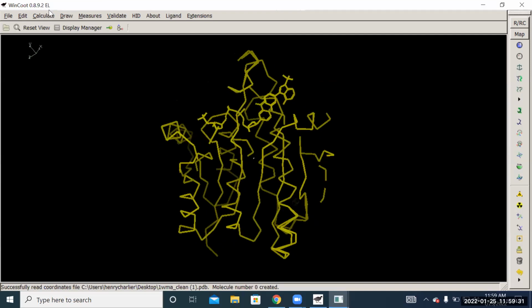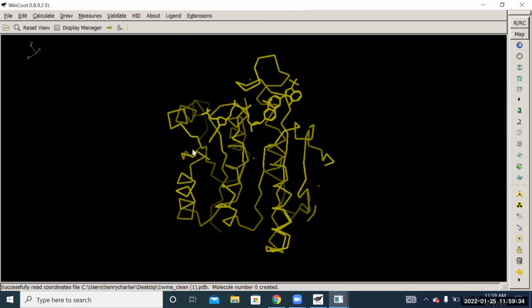And so what I'm going to do is you'll note that some of these things are fading in and out and cutting in and out. There's a way to fix that. So I'm going to make it so that the depth of view going into the Z-axis, into the screen, is going to be, I guess if you look at here, that would be the X-axis, because here are your axes that are here. So that would be your X-axis going into the screen if you were to go by that. But in terms of here's your Y, X, and then going into the screen would be Z. So that's how I was categorizing it. But this shows the axes for the actual molecule.